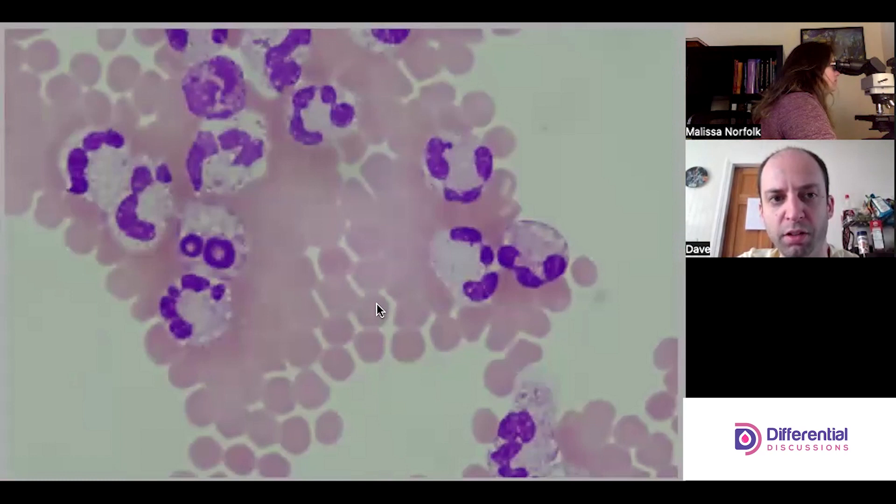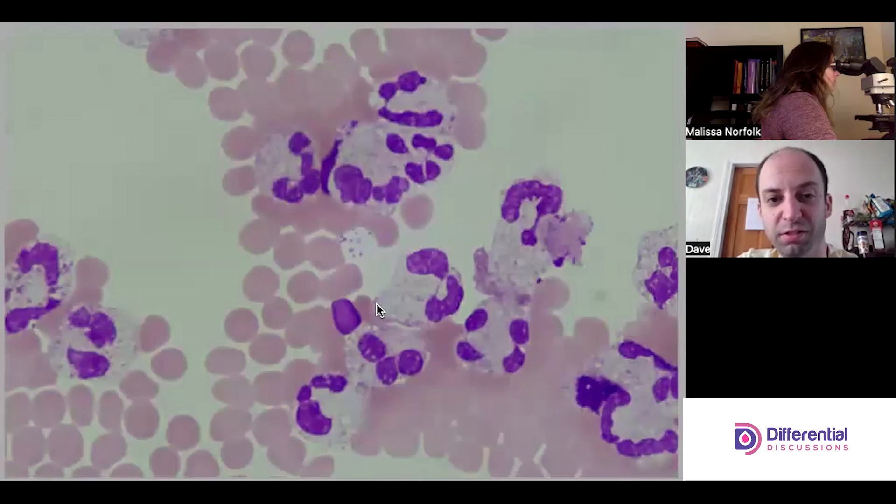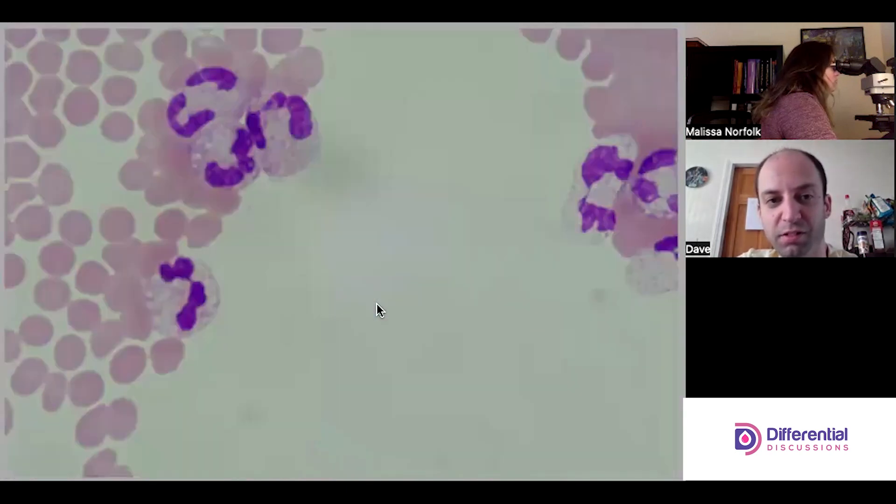I agree — and those occasional basophil-looking cells too. There's another giant clump like that.